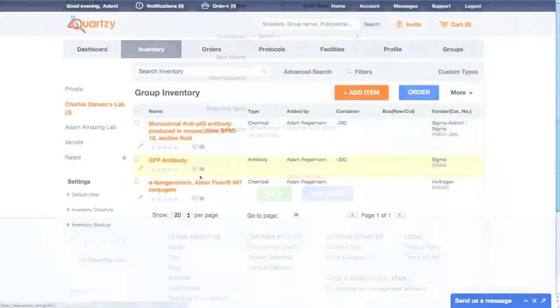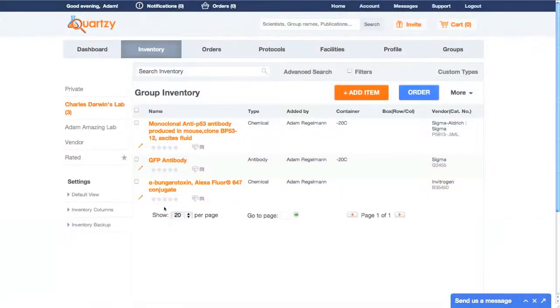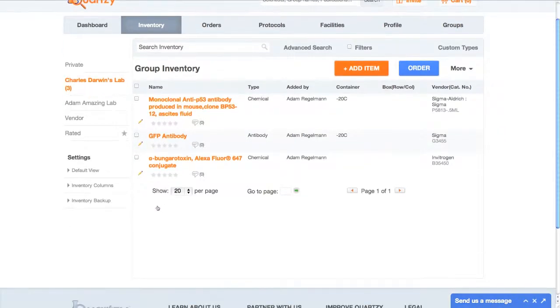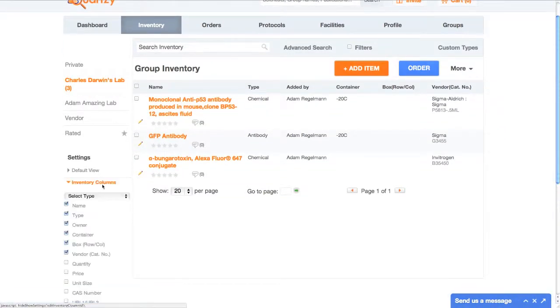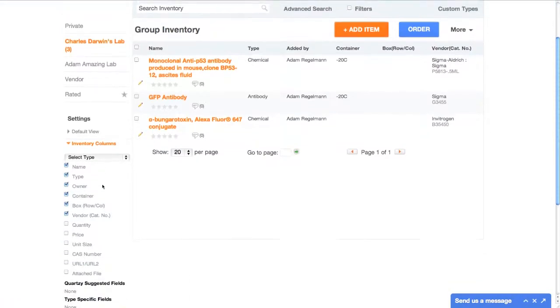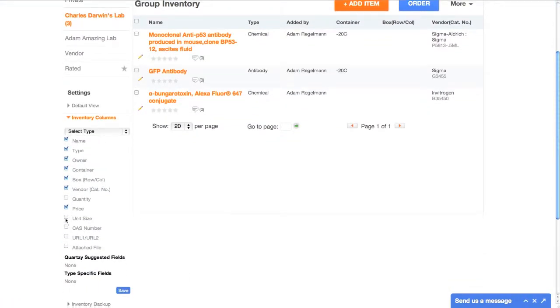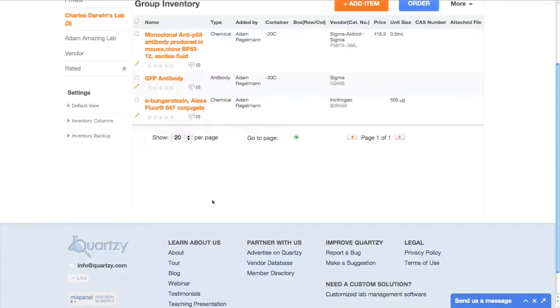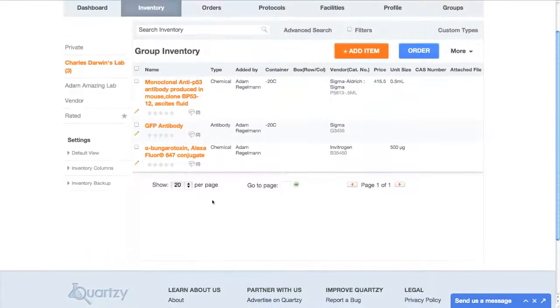Part of why Quartsy is used by tens of thousands of researchers from all over the world is because it's so flexible. For example, we even let you customize the columns you see in your inventory. I'm just going to check off price, unit size, CAS number, and file, and once I click save, those are the columns displayed.